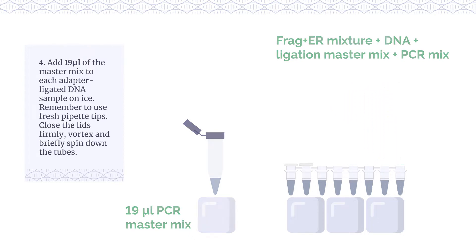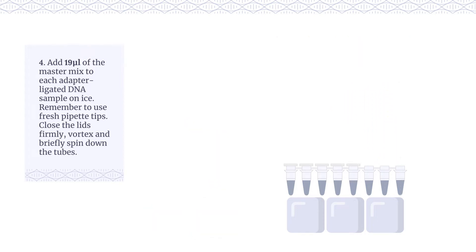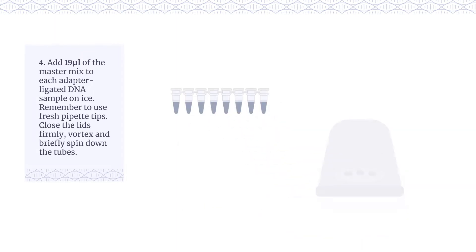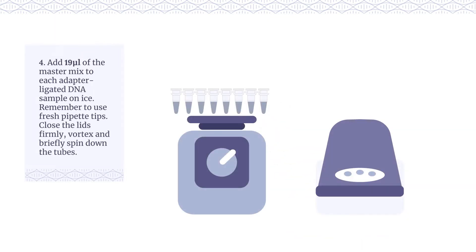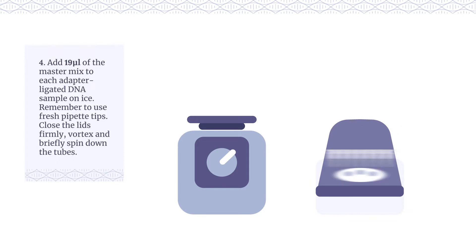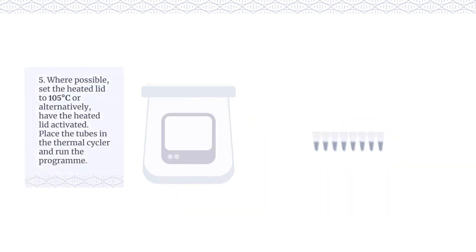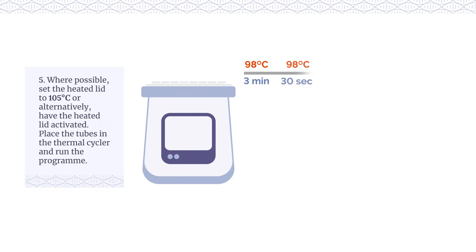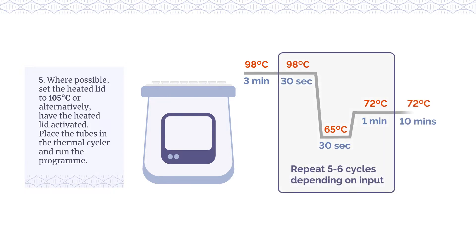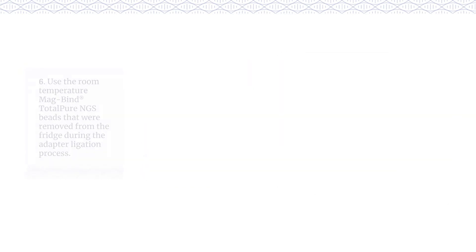Close the lids firmly, vortex and briefly spin down the tubes. Where possible, set the heated lid to 105 C or alternatively, have the heated lid activated. Place the tubes in the thermal cycler and run the program.